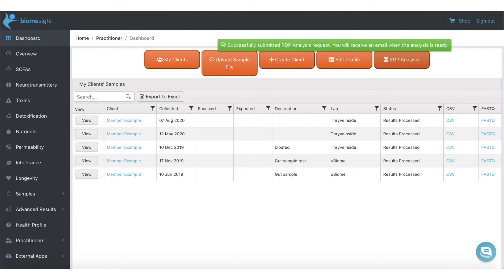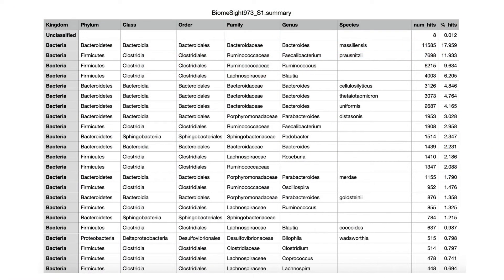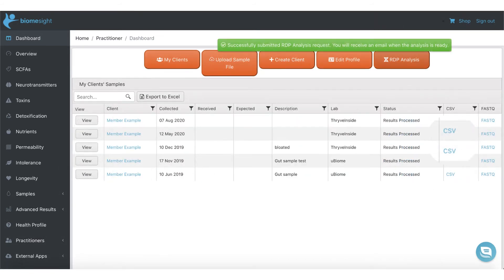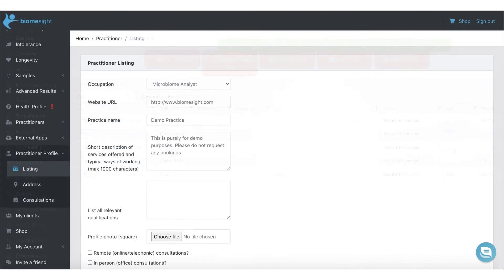BiomeSight is currently using Green Genes. Once the results are ready, you and your client will both receive an email. You can then download the analysis in CSV format using the RDP link in the samples table. On top of this, you can also download raw sequence files and CSV files.